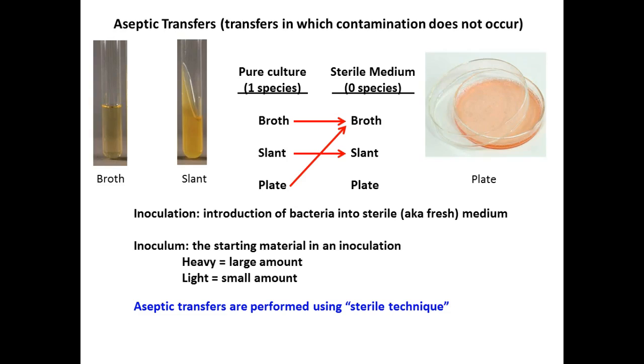They have what's called a laminar flow hood. This has special filters on it that filter the air and circulate the air, which creates a curtain of air. So the inside of that hood is a sterile environment. You don't have to do some of the steps that we're going to do, because the environment itself is clean. Unlike for us, we've got microorganisms in the air, so we have to constantly keep flaming things, even the air within the opening of our tube.